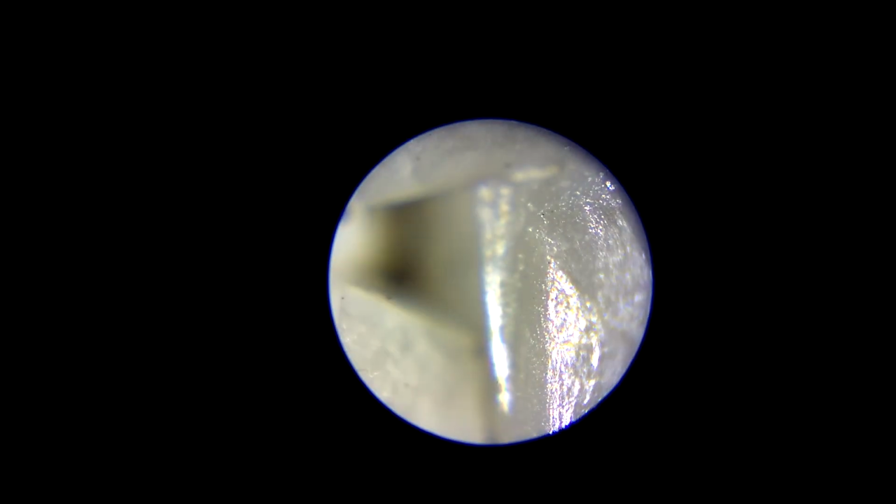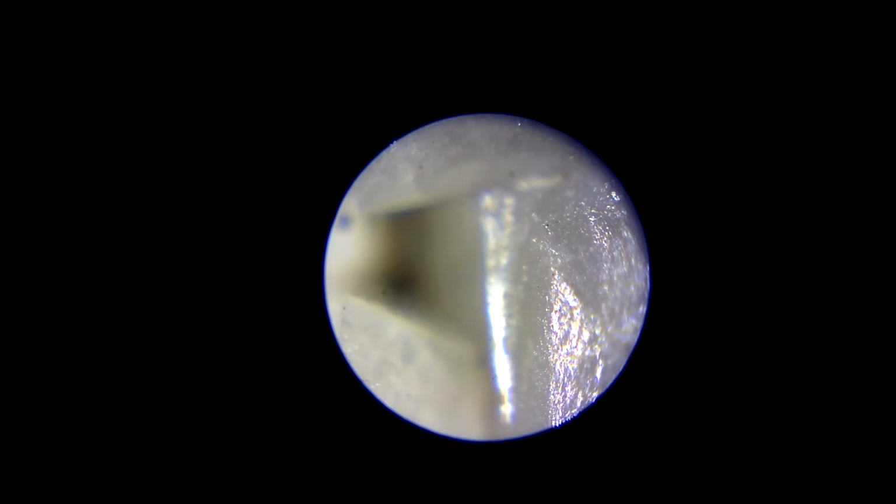Sorry if my dog barks, but as you can see, this is the edge of a crystal, and as you can see, it is quite flat and smooth. Now this is on 60 times magnification. Let's go to 120. Here you can see the edges are even more prominent with that straight line.